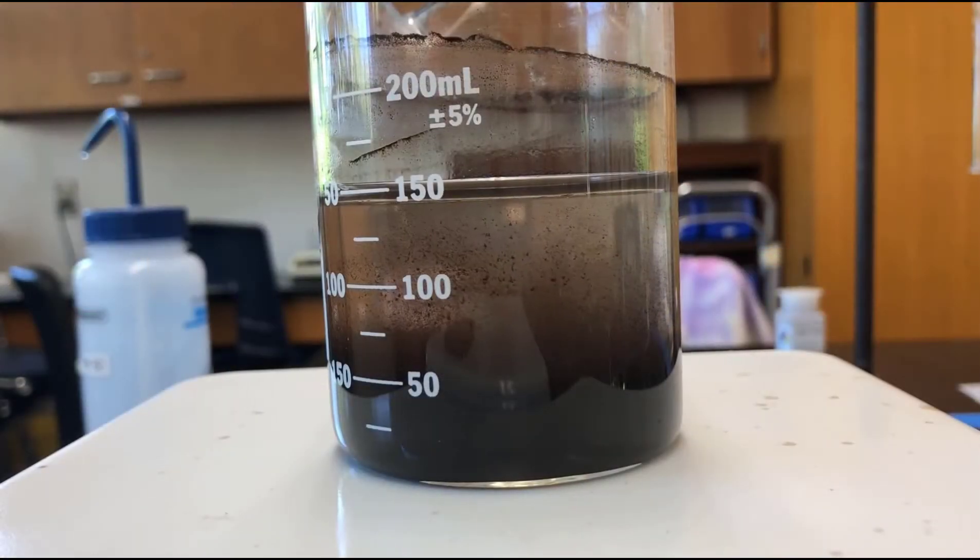You can see how cloudy that is — that's from the addition of the 100 mLs of water. We need to heat it, as that often helps it to clear up. So we'll turn the stir back on and we'll turn the heat back on.